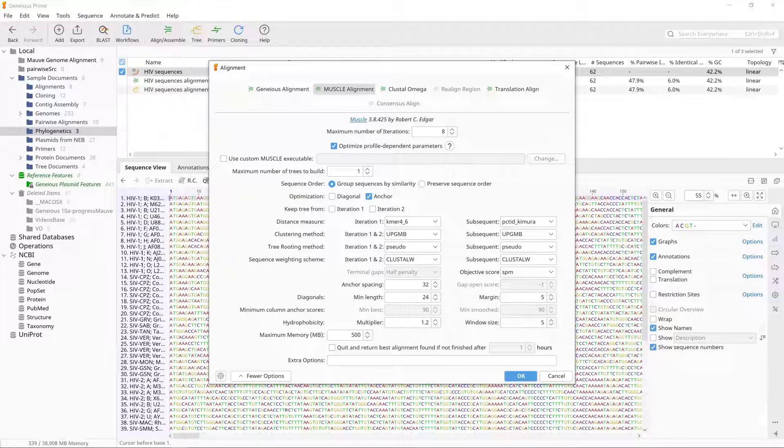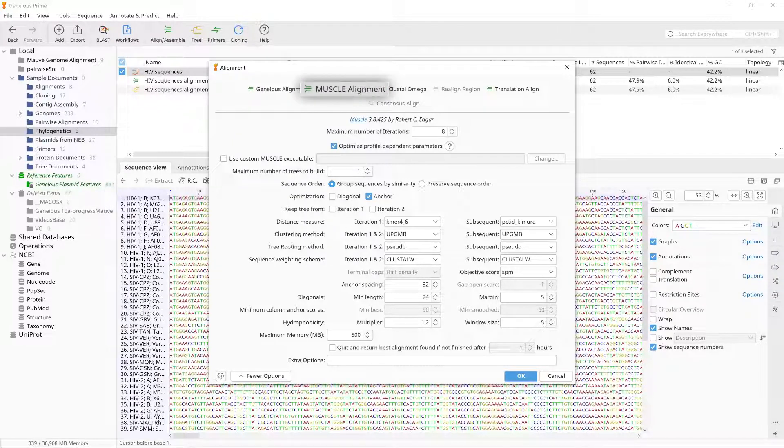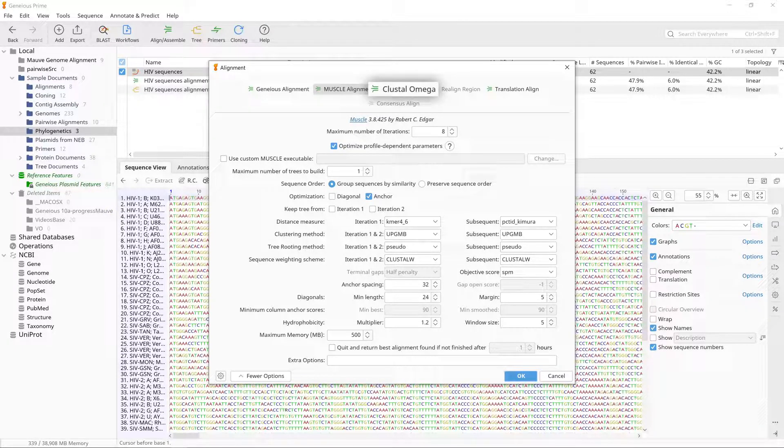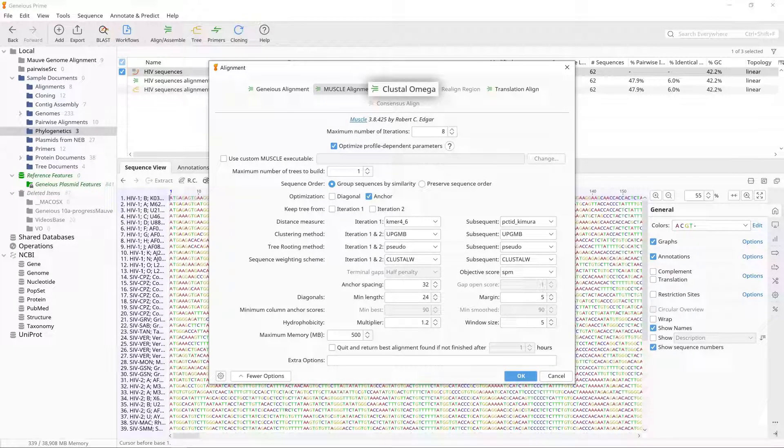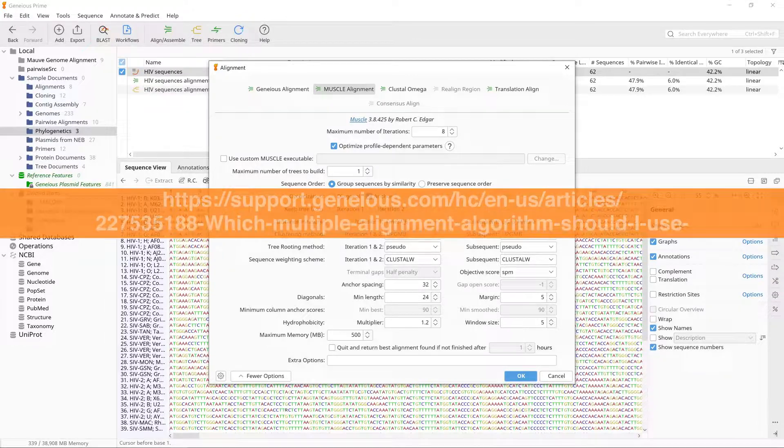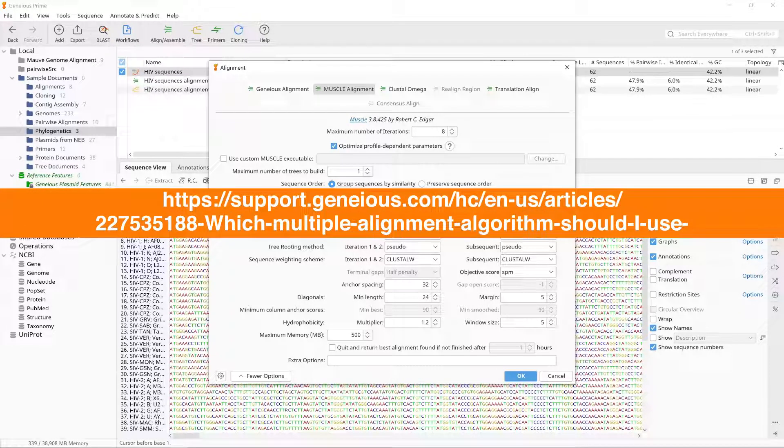The alignment algorithm you should use depends on your data. The Geneious Aligner should only be used on small datasets. Muscle for medium alignments, and Clustal Omega or MAFT should be used for large alignments. For more help on choosing the appropriate aligner, please see this article in our Knowledge Base.